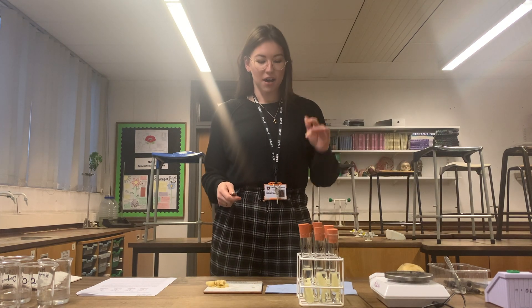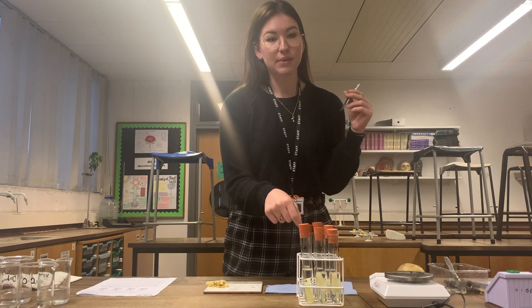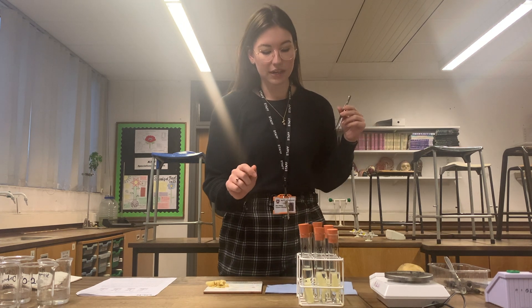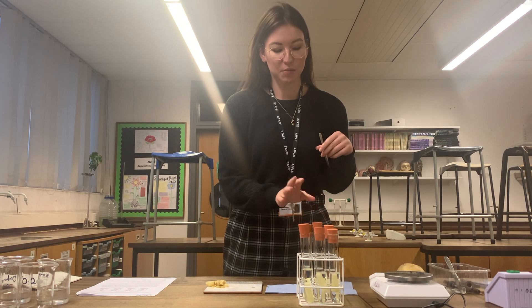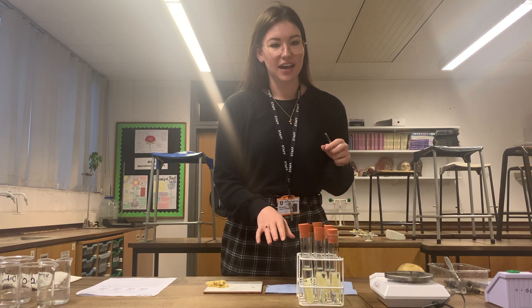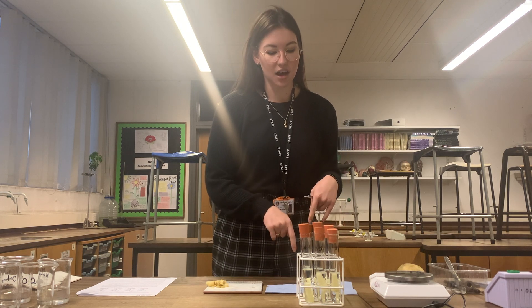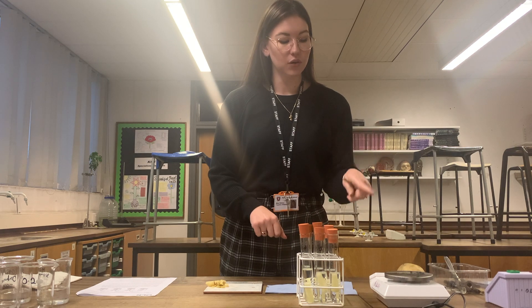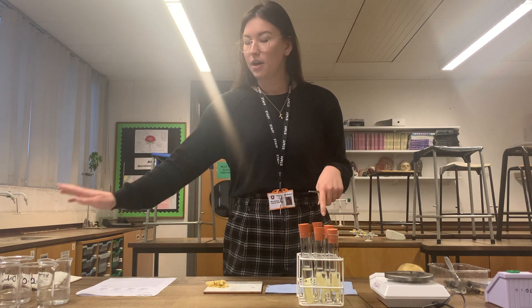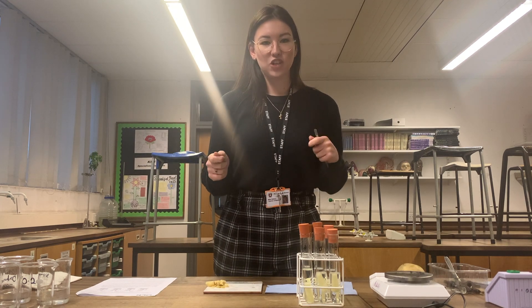An hour has passed. I need to take out each of the potato cylinders from their boiling tubes and put them in order so I remember which potato tube is which. Once I've done that, I need to dry them by rolling them in paper towel three times, the same for all of them. Then I will weigh them again, record their final masses, pop that into my results table, and then I can calculate percentage change.